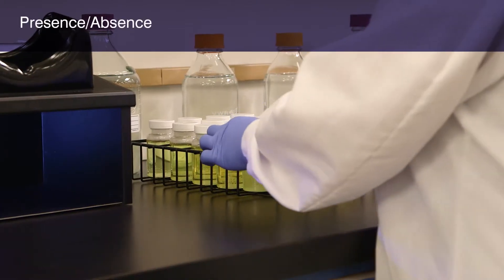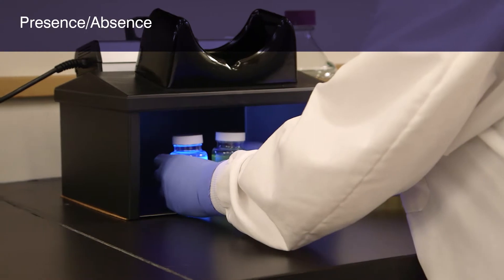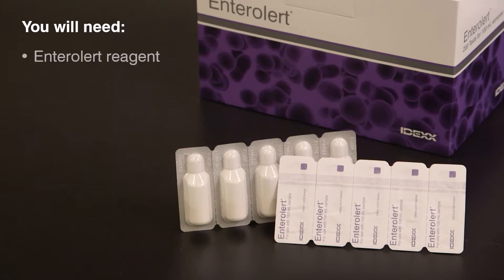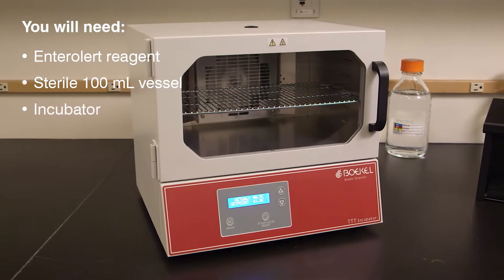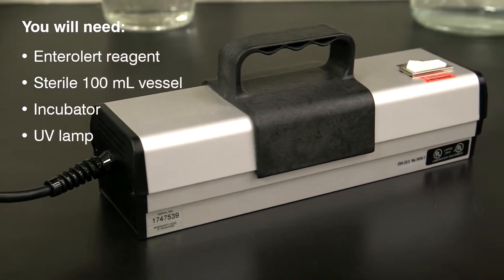In the first demonstration, you will see how to use the Entralert test for presence-absence detection of enterococci. You will need the Entralert reagent, a sterile, transparent, non-fluorescent 100 milliliter vessel, a temperature-controlled incubator, and a 6 Watt, 365 nm UV lamp.